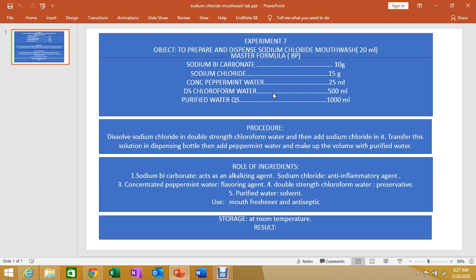Finally, make up the volume with purified water. This is a simple procedure: weigh the ingredients, mix them, transfer into a dispensing bottle, and then proceed with labelling.